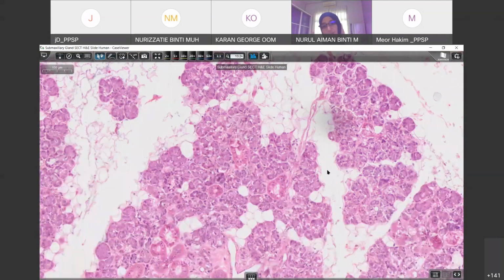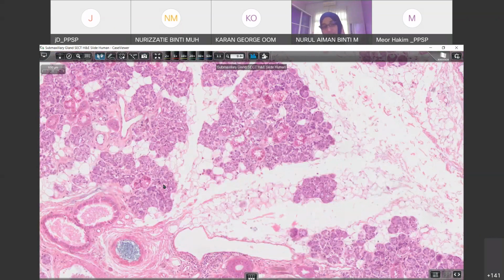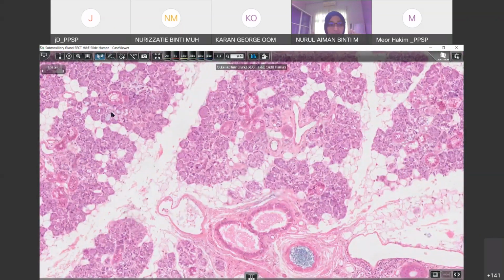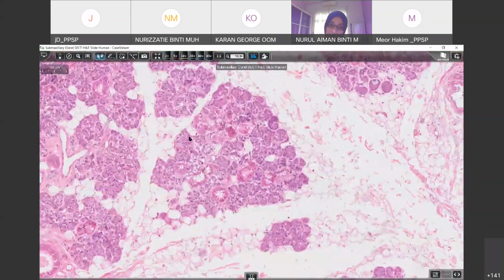Sometimes there may be one tubular structure, like the one I showed just now, but it's not dominant, so just ignore that. You can consider 90% of the population of these glands as acina and serous type. So we cannot see the lumen. They have a lumen, but it is very small because it is too compact. Tubular glands are long.